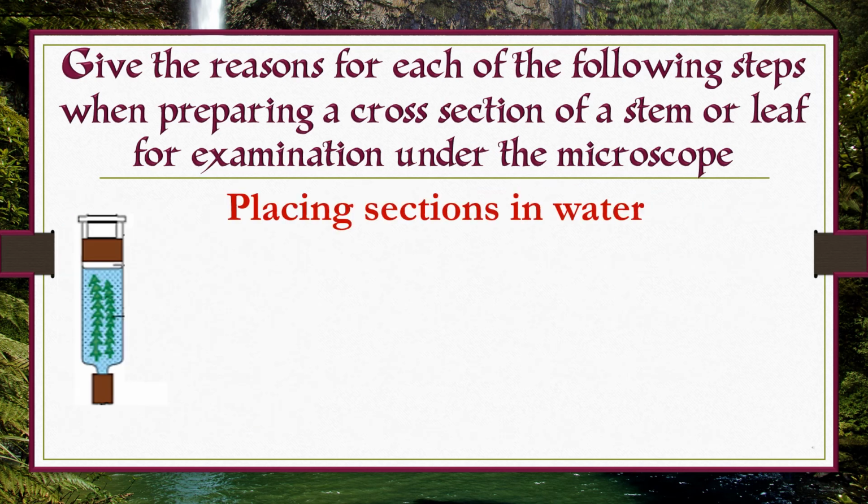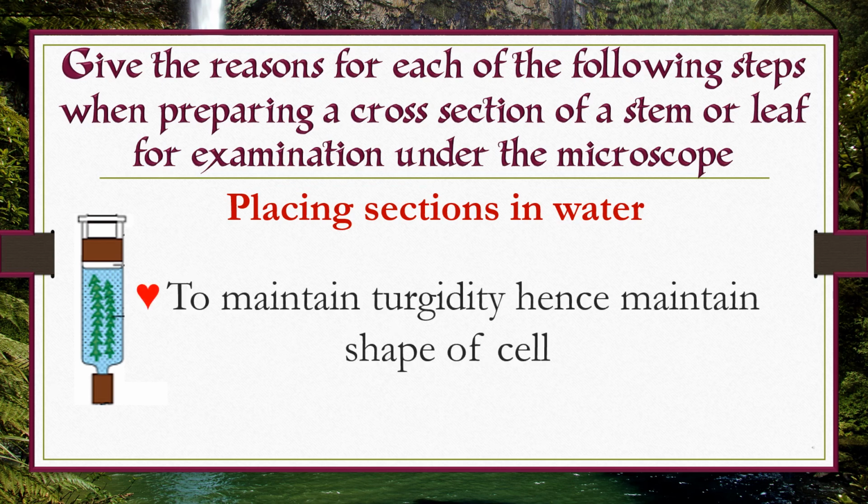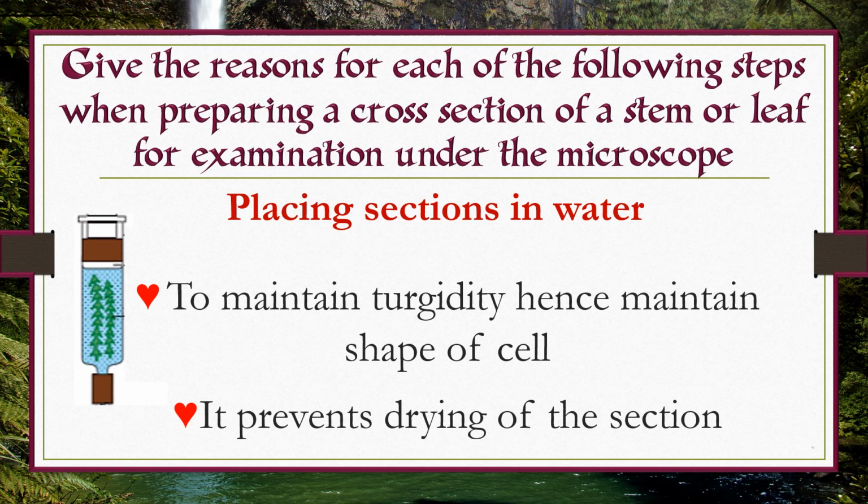Placing sections in water. The purpose of placing sections in water is to maintain turgidity, hence maintain the shape of the cell. It also prevents drying of a section.